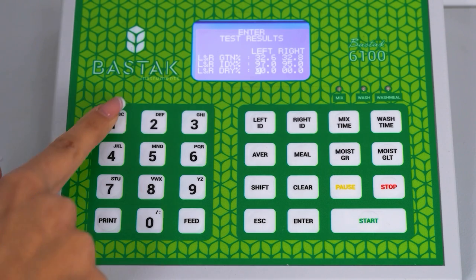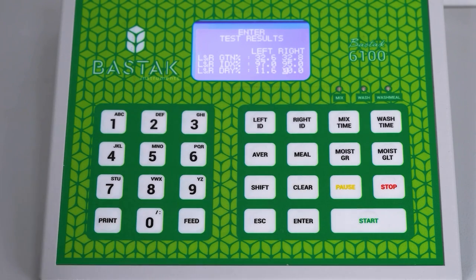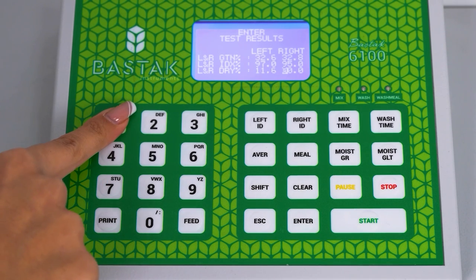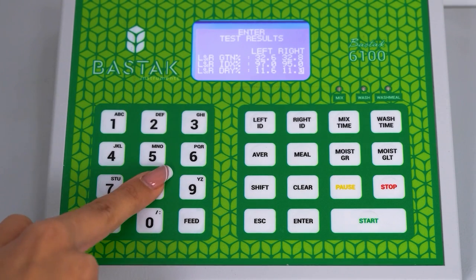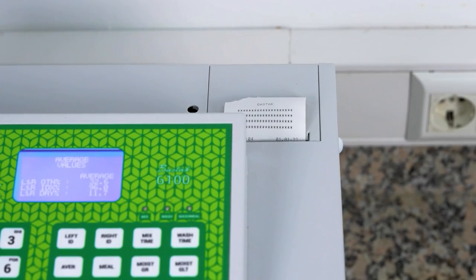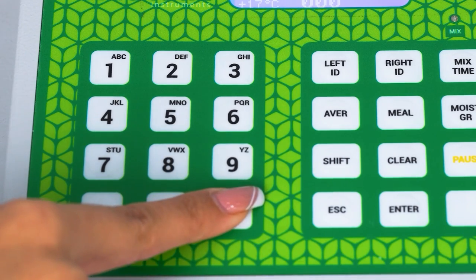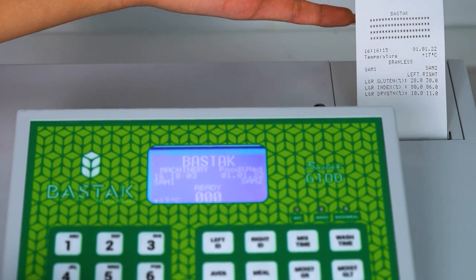The dry gluten value on the left side of the device screen is entered as 11.6 and saved. The dry gluten value on the right is entered as 11.8 and saved. Then, by pressing the print button again, the printout is taken. By pressing the feed button, the output length of the paper is extended in order to tear off the printout more easily.